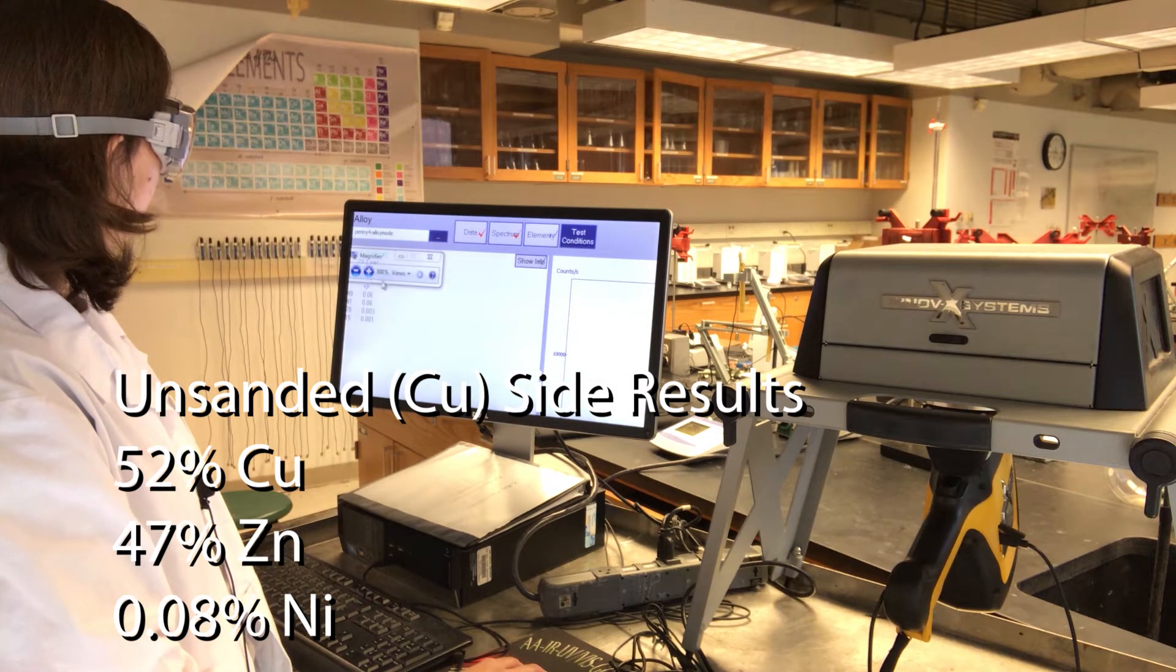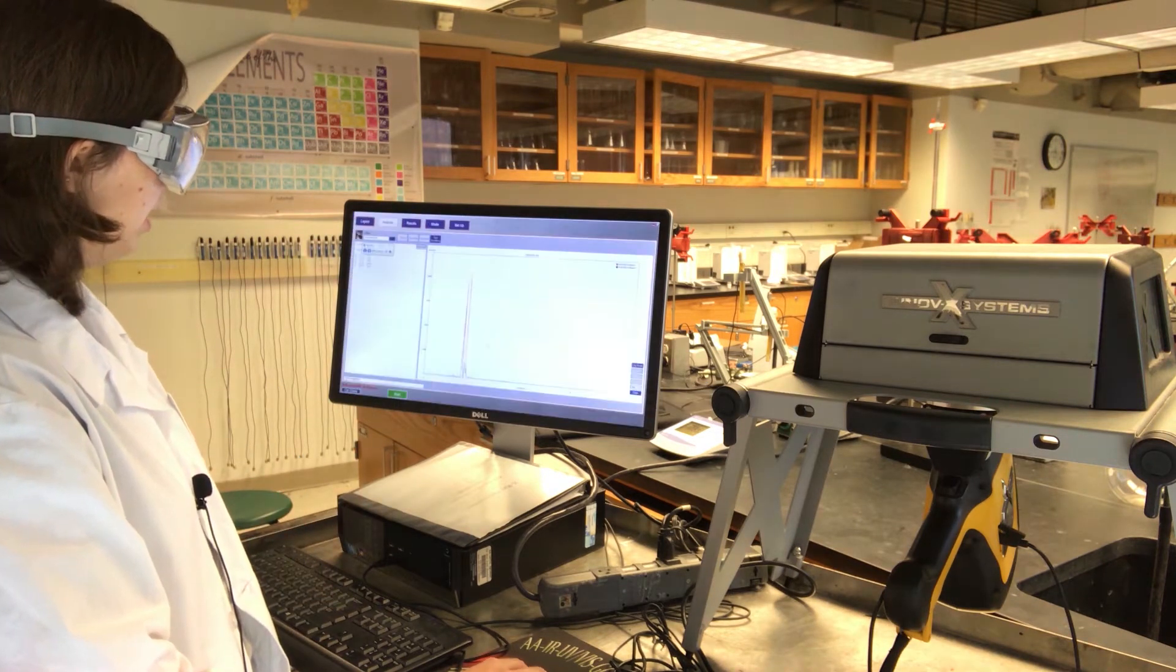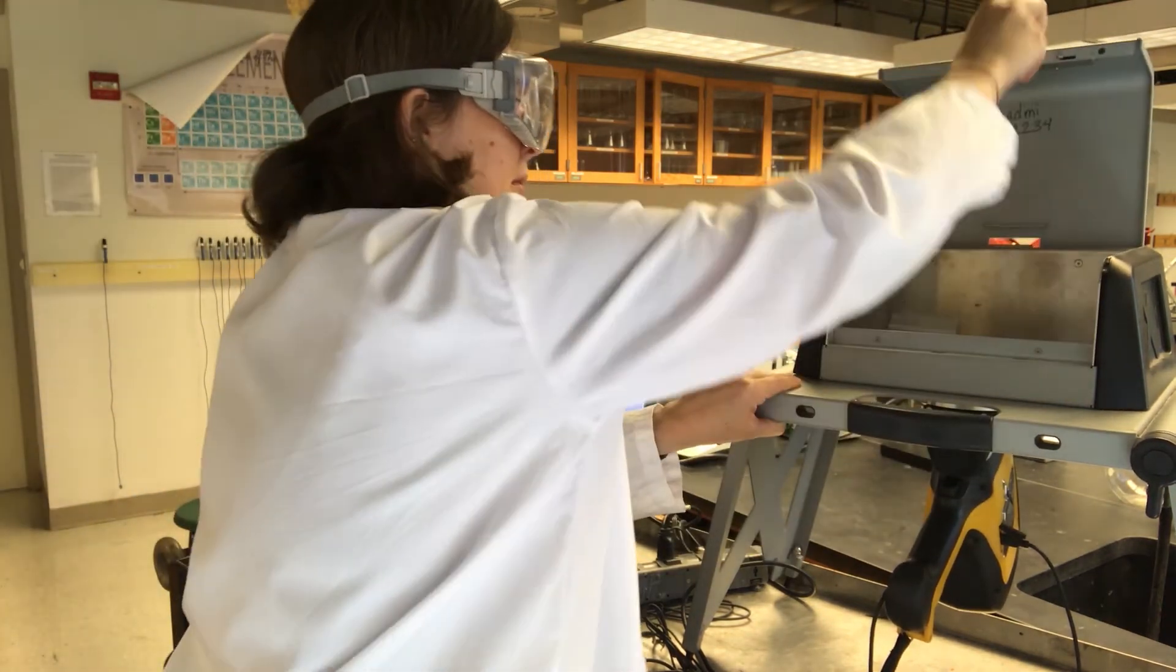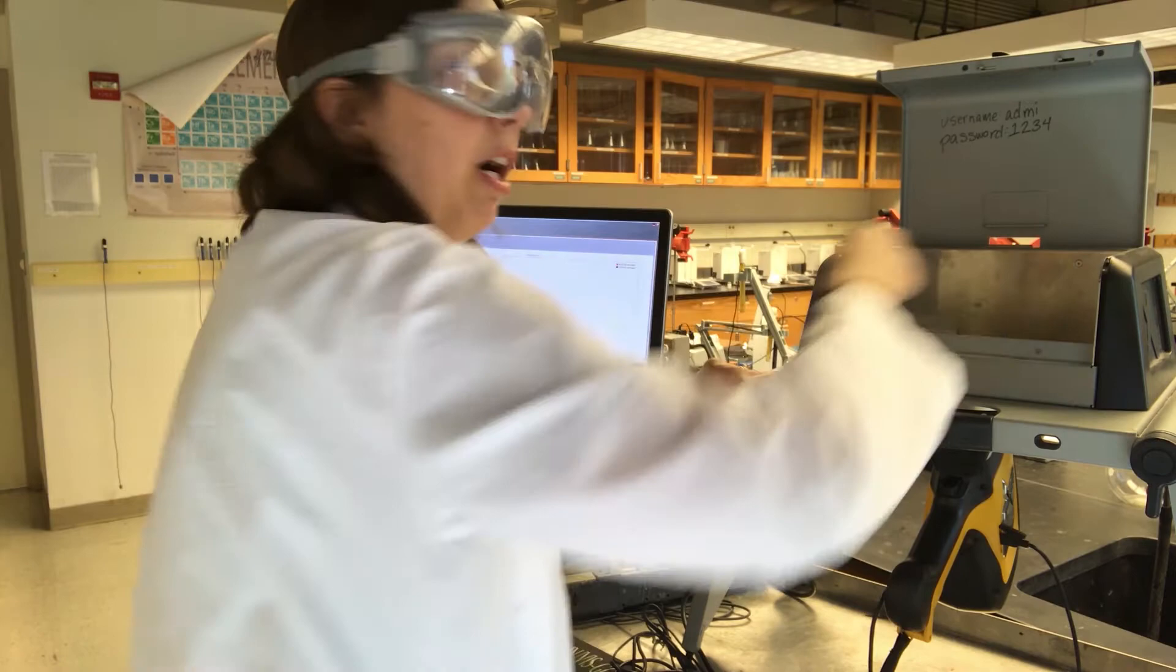I'm going to zoom back out and show that there is a spectrum associated with this. That was the copper side of the penny.